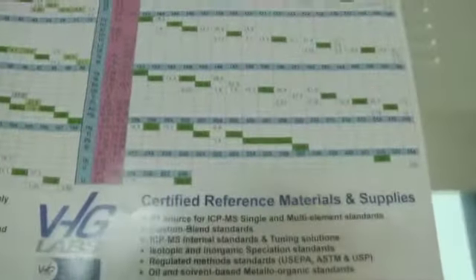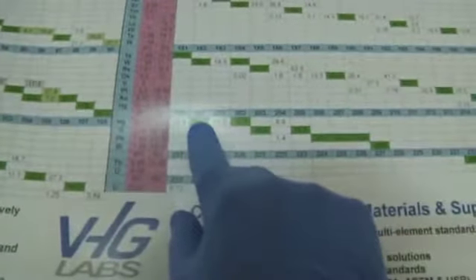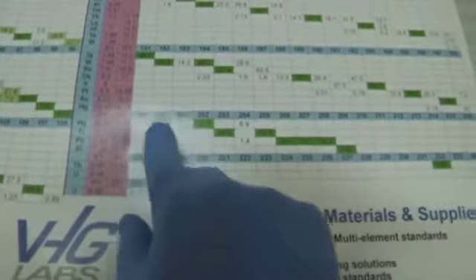But if you go over here to the ICP-MS mass selections with percent elemental abundance and ionization potentials, if you look, for example, at mercury, these are the ionization potential columns. But what I'm really interested in on mercury is here, which shows the isotopic abundance percentages in nature. These are the atomic mass units for mercury: 199, 200, 201, and 202. And this chart shows you the relative abundance of those different isotopes in nature. For example, mercury at mass 202 exists at about 29.9% in nature.